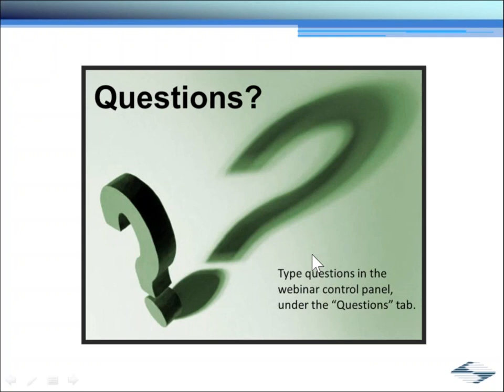It can be used for a little extra fluorescence collection as well. Yeah, so actually a couple of other details. We have had some people add substage detectors to the MOM. It's a little bit difficult actually because you have to coordinate their movement with the positioning of the head of the MOM, unless you want to actually just set the MOM in a specific location and not move the slides.